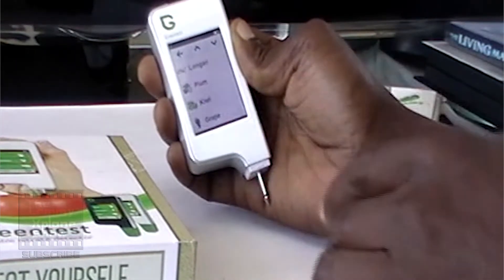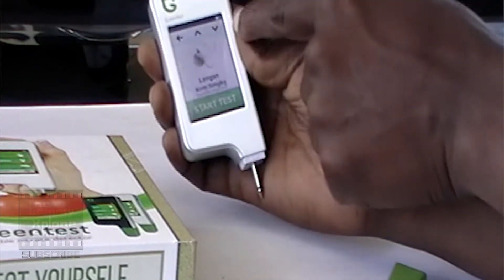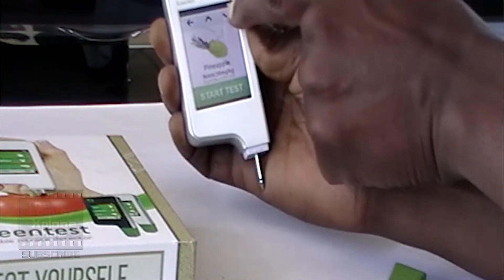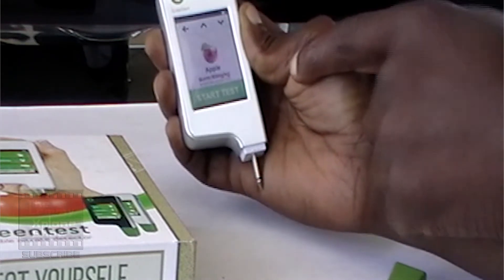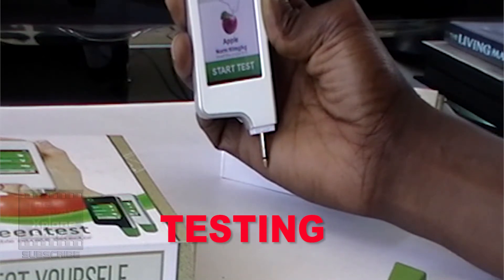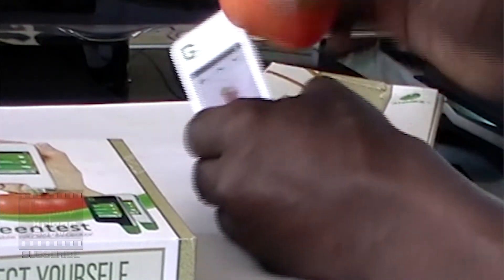I'm going to be testing fruit. We've got a banana, a nectarine, an avocado, and we're also going to test an apple. Let's start with the apple. On the screen it's telling me the normal will be 60 milligrams per kilogram. To test, I have to insert the probe into the fruit and then press start. This particular apple says it's organic — it's a Pink Lady. We're going to take our probe, dip it in, and press test.